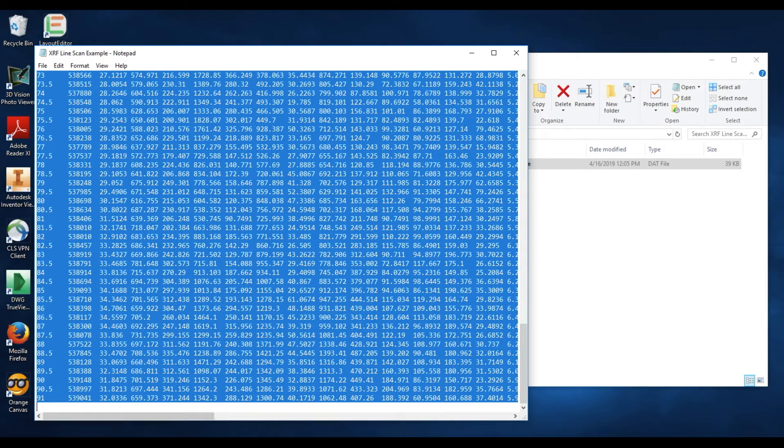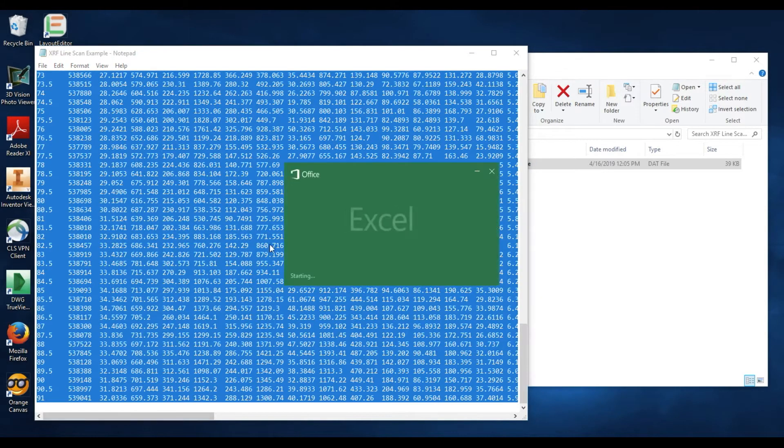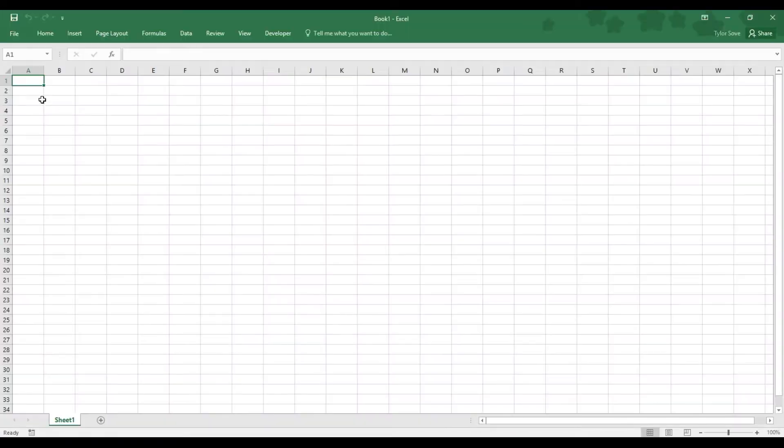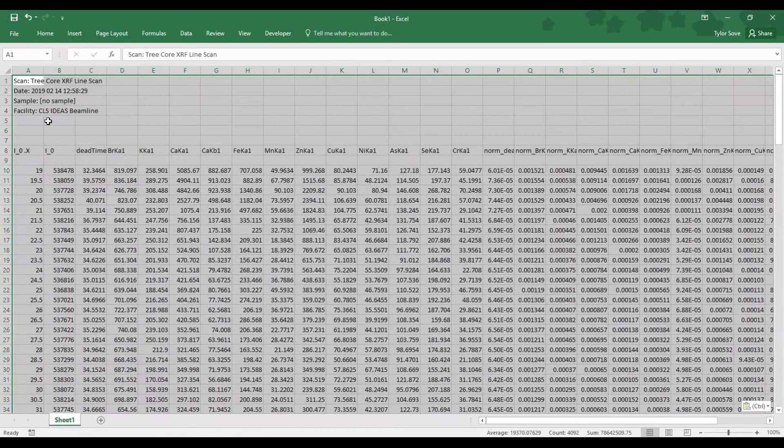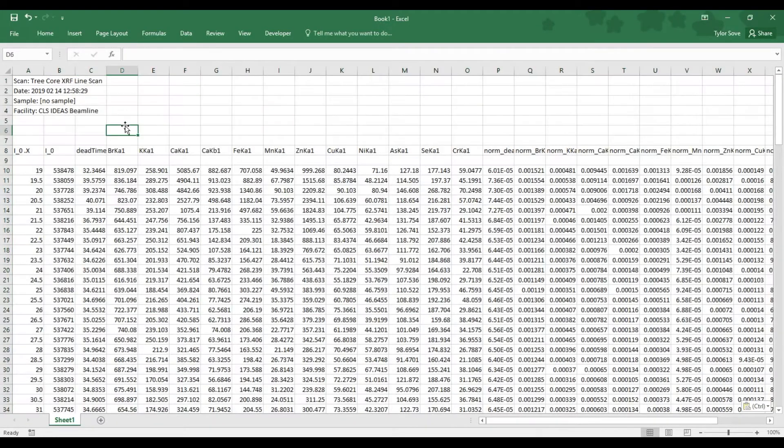Do so by opening up an Excel workbook and in cell A1, right-click it and select the Paste icon. Now we've imported the data into Excel.